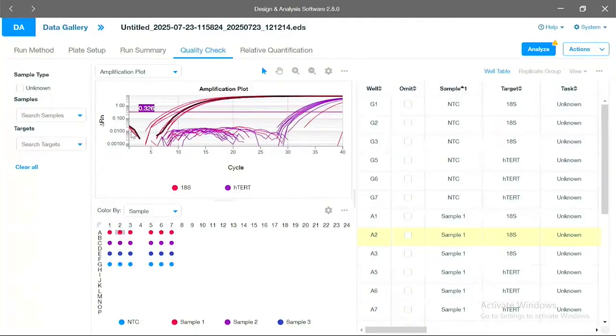The caveat is that if you assign the whole plate with a sample name or target name, it will go ahead and use all of those wells for that assessment. So if you only have 5 samples in a plate, you now have most of the plate being erroneous data, and you'll likely get some weird reports back. So just make sure that the assignments are only for sample-containing wells.